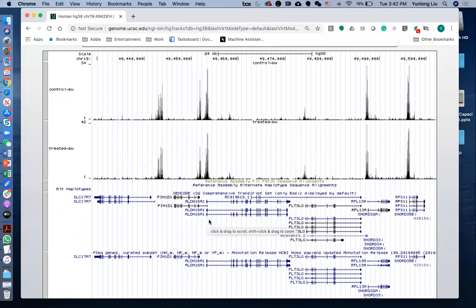Now you are seeing, oh, this part is beautiful. Let's look at it. This part of the chromatin is open, and it corresponds to the promoter region of this particular gene. And these two are very clearly open chromatin regions in the beginning part of this particular gene. And the same thing happens here.